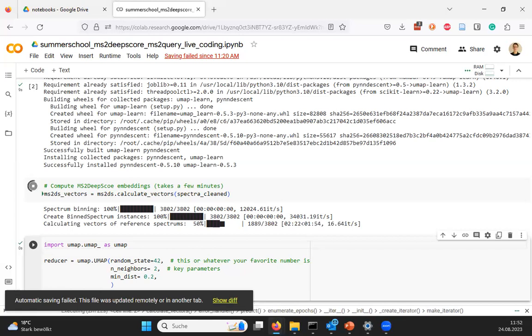And it also turns out, because of this deep learning network, because the intensities are in there too, even if you have noise peaks or if you remove them, it changes hardly anything. It's more about, of course, the better the spectrum quality, the more fragments you have, the more information you can potentially get out of this.